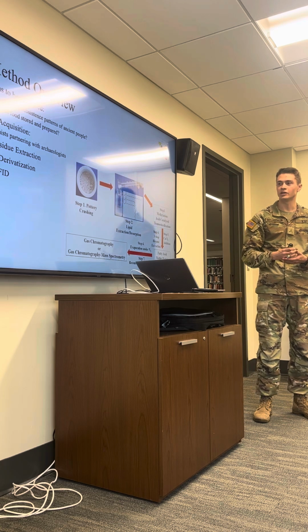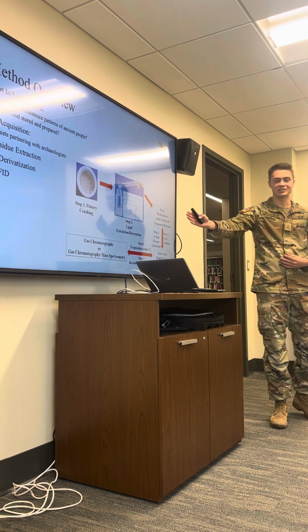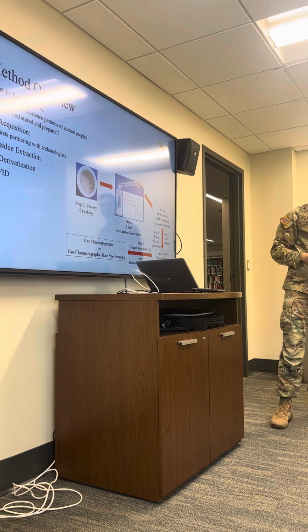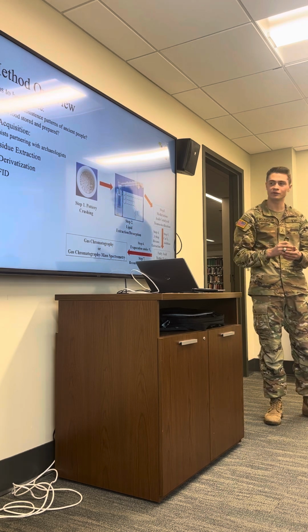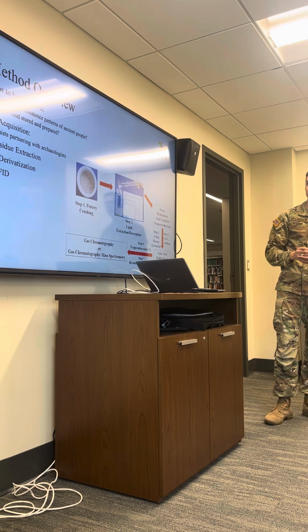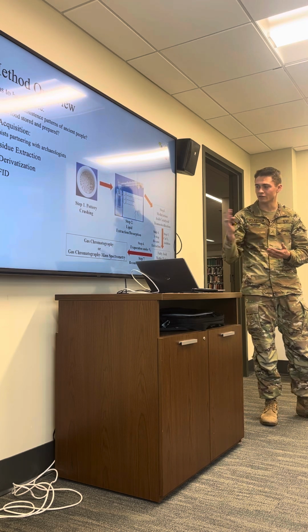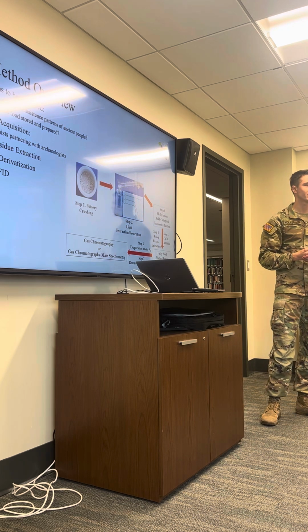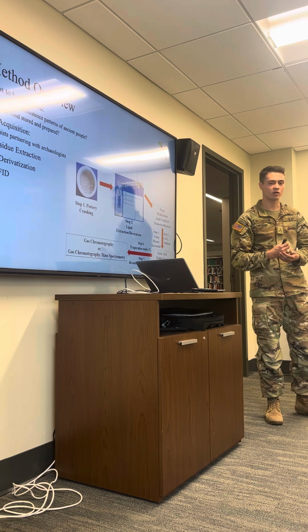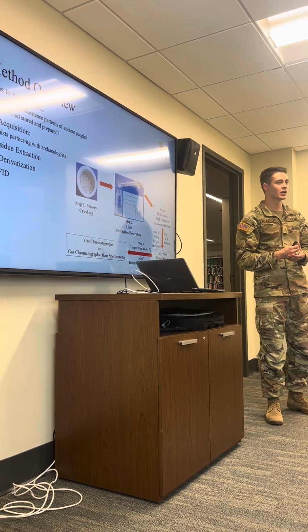And then the next step begins with the lipid residue extraction. It involves the crushing of pottery. It is a destructive method, and then we extract the lipids or molecule of interest from the pottery fragments. And then we have residue derivatization, by which we have the lipids undergo a reaction in order to turn them into something called fatty acid methyl esters, which are a species that are chemically viable for GC-MS analysis.